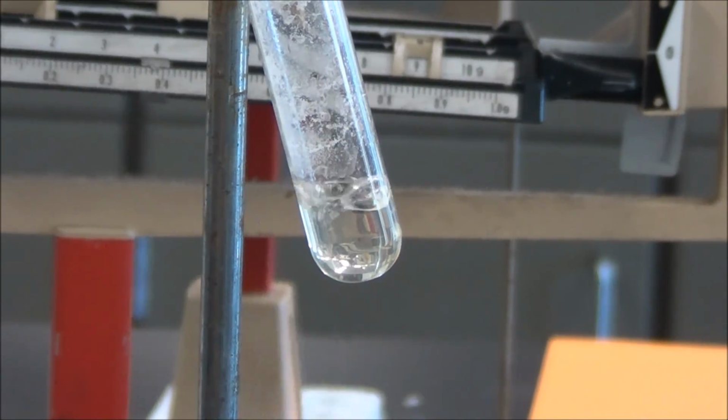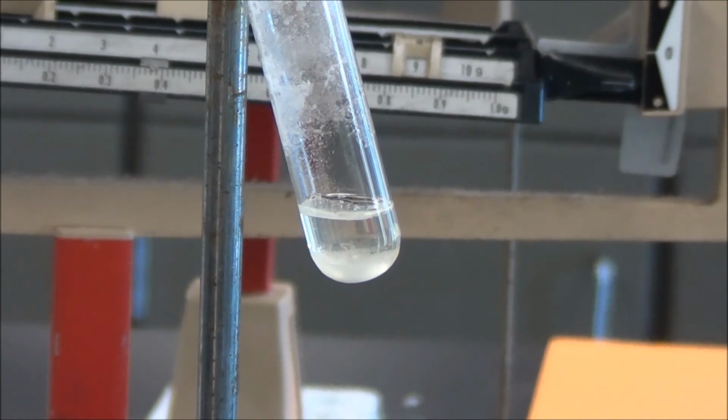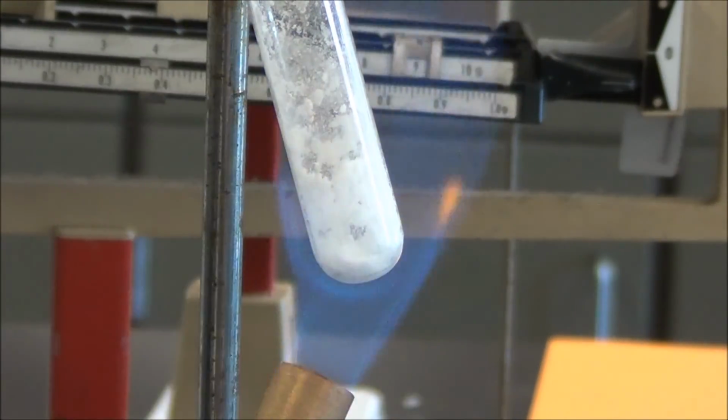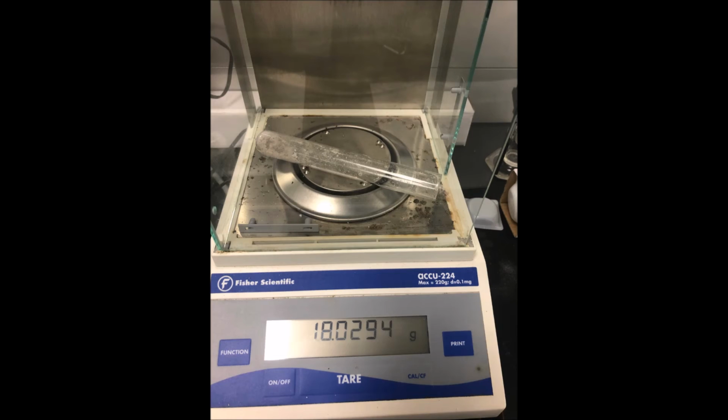At this point, the salt is under so much concentration that it has actually affected the boiling point of water. Water is no longer boiling at 100 degrees. So as you can see, I have to hit it a little harder with the Bunsen burner, and I keep hitting it hard until there's no more noise of any water molecule that is still trying to get out. So what you see here is the mass of the salt and the test tube together.